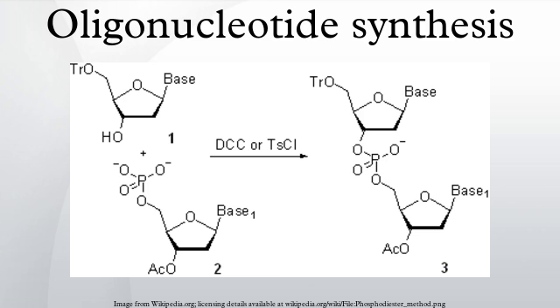However, the reagent is of limited stability in solution and is less efficient in sulfurizing RNA linkages. N,N'-tetraethylthiuram disulfide, TETD, is soluble in acetonitrile and is commercially available. However, the sulfurization reaction of an internucleosidic DNA linkage with TETD requires 15 minutes, which is more than 10 times as slow as that with compounds 3 and 4.